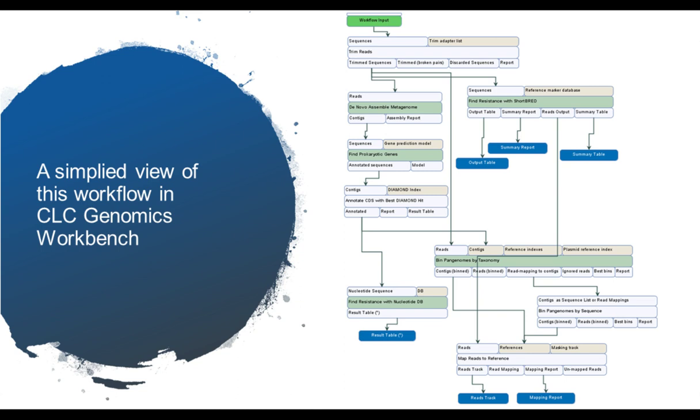And it's a matter of just simply dragging and dropping individual tools and algorithms from the toolbar onto a canvas, and then attaching outputs of one algorithm into the inputs of another, and then configuring the underlying parameters of each of those algorithms if you decide to. Oftentimes, the default values for our algorithms suit the purposes of our users quite well, but you, of course, have full flexibility in tuning the individual parameters of each of these tools as needed.